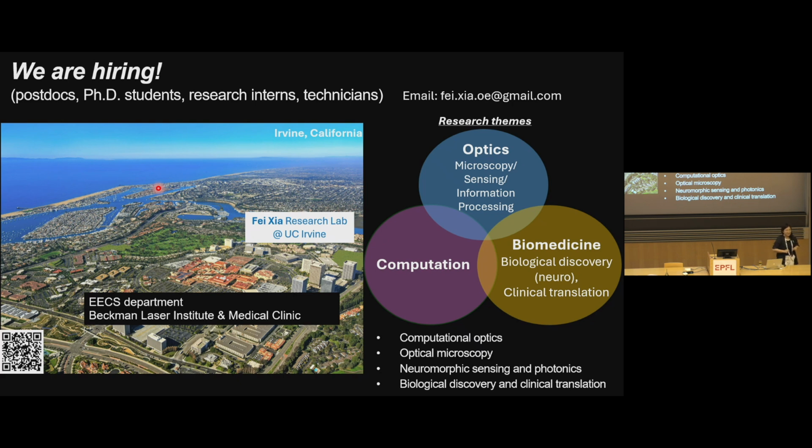That's not what I meant. I meant you can focus on a line. Instead of having a focus on a spot, you can focus on a line, and that would be a line that would integrate the emission on a horizontal line rather than a vertical line. That's kind of the detection, right? Or I'm saying the scan, you're doing scanning in 3D in any case. Your point spread function is a vertical segment. Yes. It could have been a horizontal line segment as well.